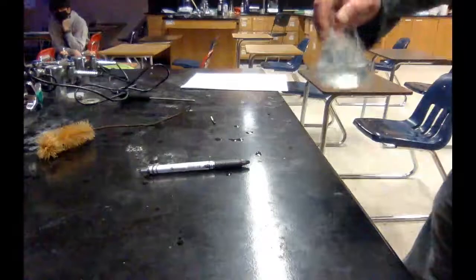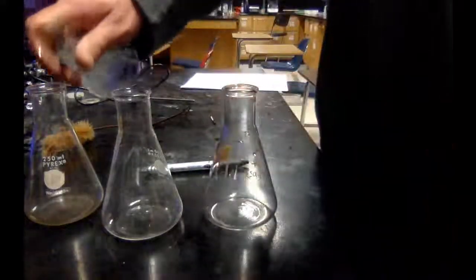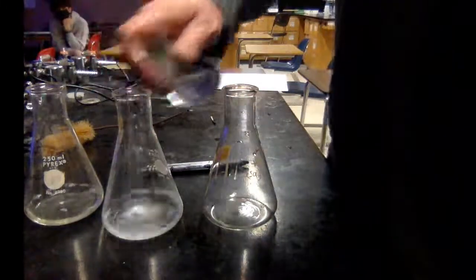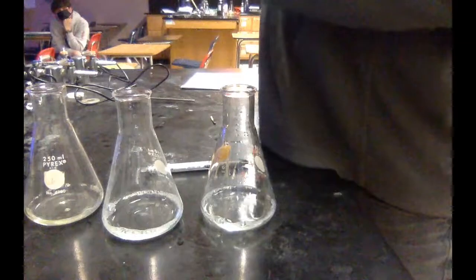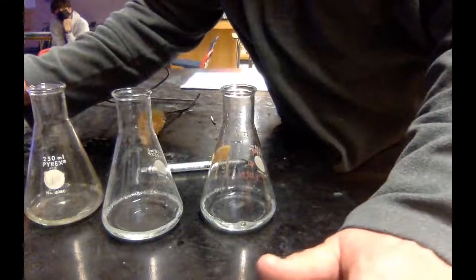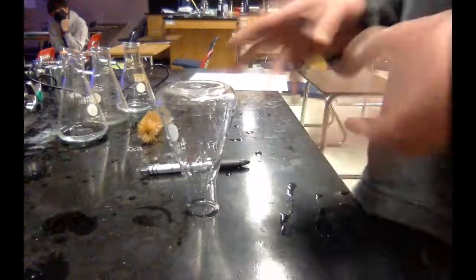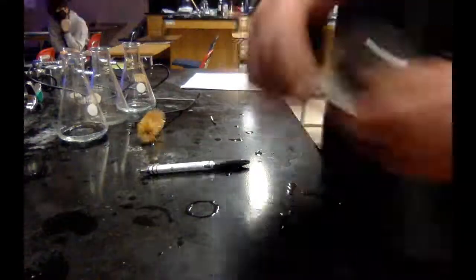All right. So somebody should be on cleanup duty. And remember what I said about soap. This is enough soap to probably get all of these. This is not a great way to set these unless you know that nobody's going to be over here messing around, right? So be careful with that.